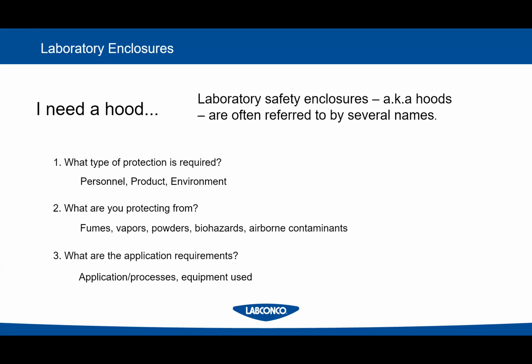A lot of people think a hood always protects people. That's not necessarily the case. There are enclosures out there that provide product protection only, that don't protect the people. And you might say, well, why would I need that? We'll get to that in a minute. But do you need to protect the product? Do you need to protect the person or the environment or all 3? What are you protecting from? Do you have fumes, vapors, powders, biohazards, airborne contaminants? What are you working with?